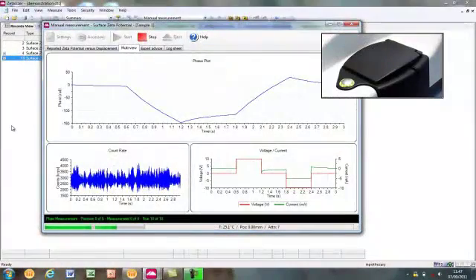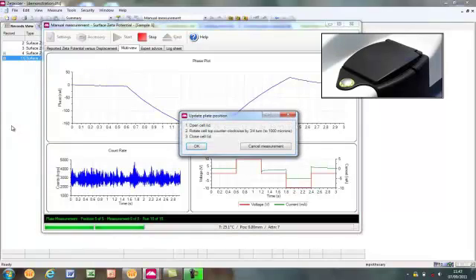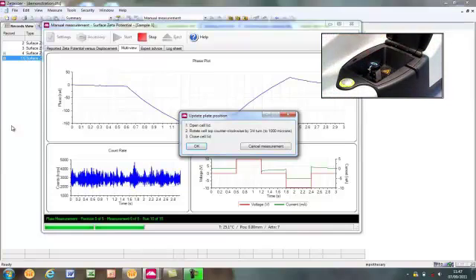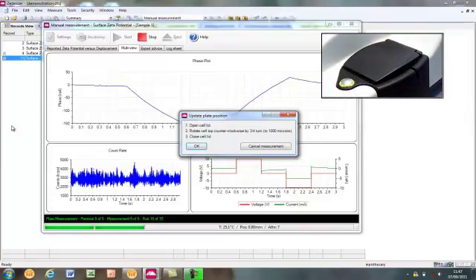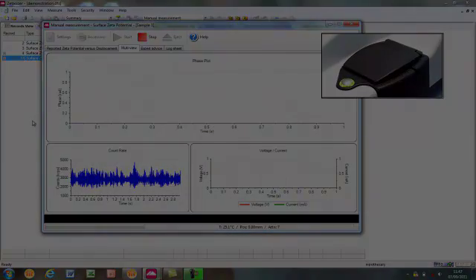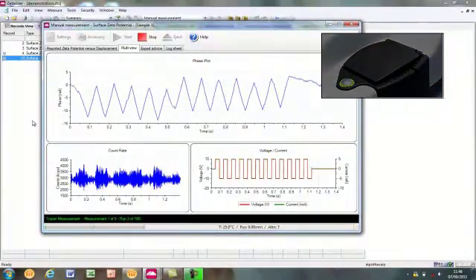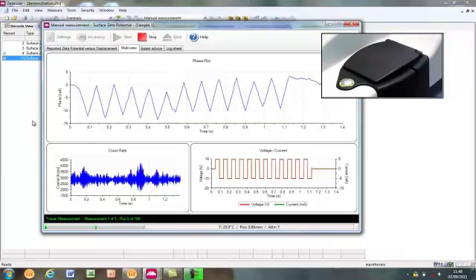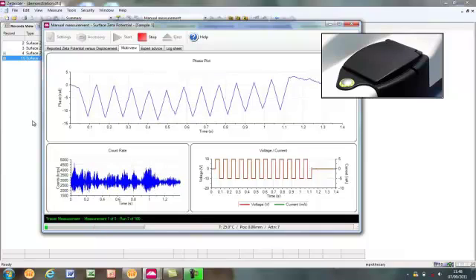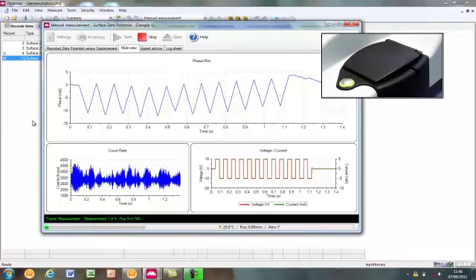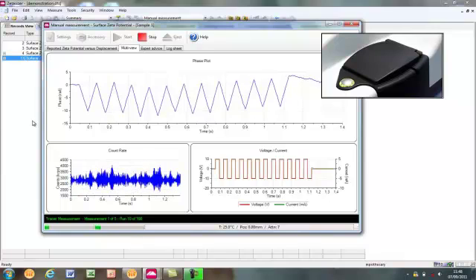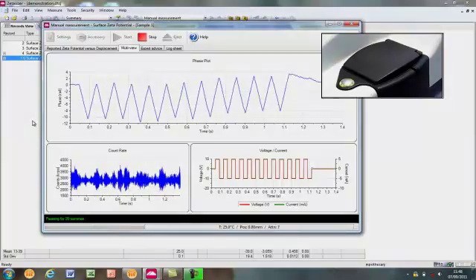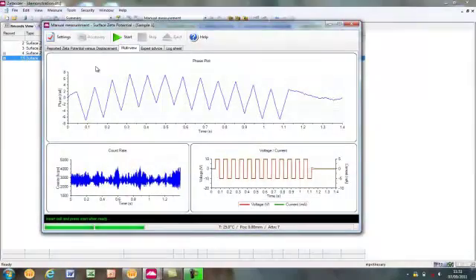After all of the measurements have been performed at each of the measurement positions, the final electrophoresis-only measurement is performed. The software asks for the final repositioning of the sample by turning the cell cap. As with previous displacements, this involves opening the lid, turning the cell cap by the required amount, closing the lid, and clicking OK. It is worth noting that the size of the turn on this occasion may be different from the previous ones depending on the settings defined in the SOP. The software then performs a series of fast field measurements. The purpose of this is to measure the electrophoretic mobility of the tracer particles independently from any electroosmotic effect generated by the sample. This, along with the intercept, is then used to calculate the surface zeta potential of the sample.